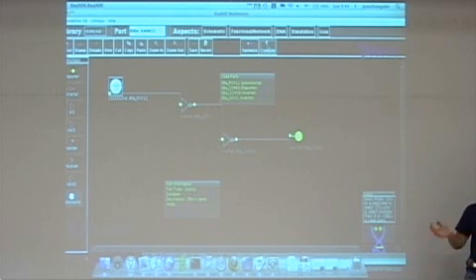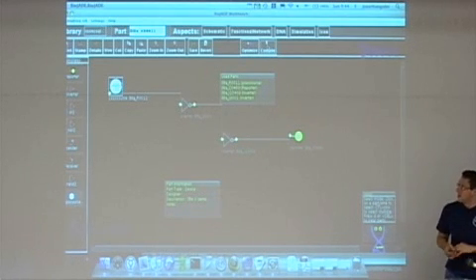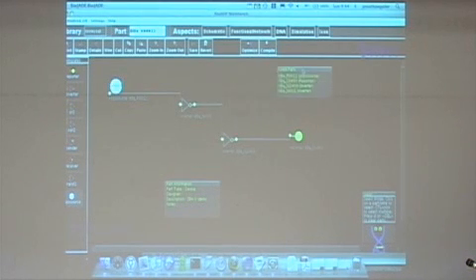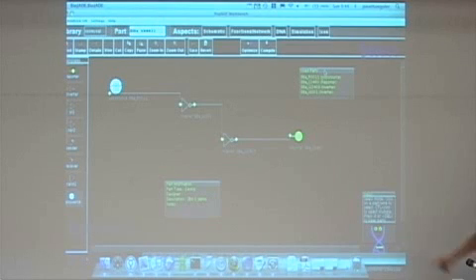So if parts internally contain various proteins, it keeps track of these and which ones are incompatible. And it gives you a list of the parts that you're using. It's up there. And it shows you for each part which one has been allocated here. So this is C0460, which is one of the fluorescent proteins.